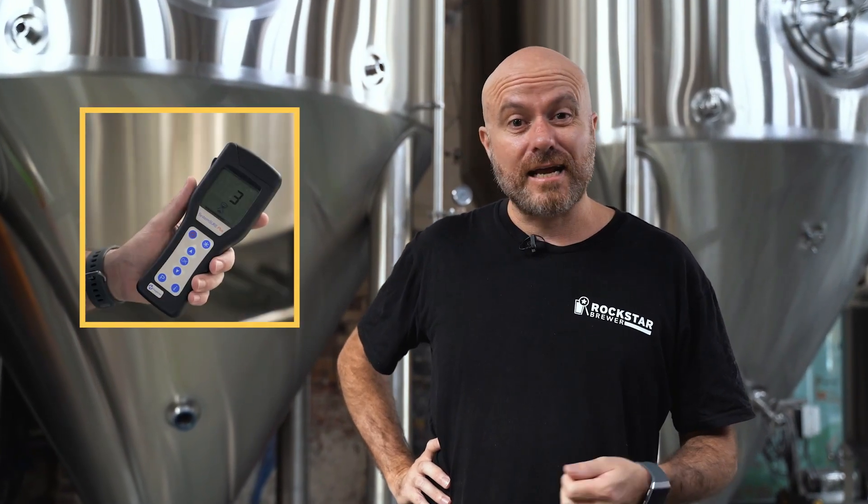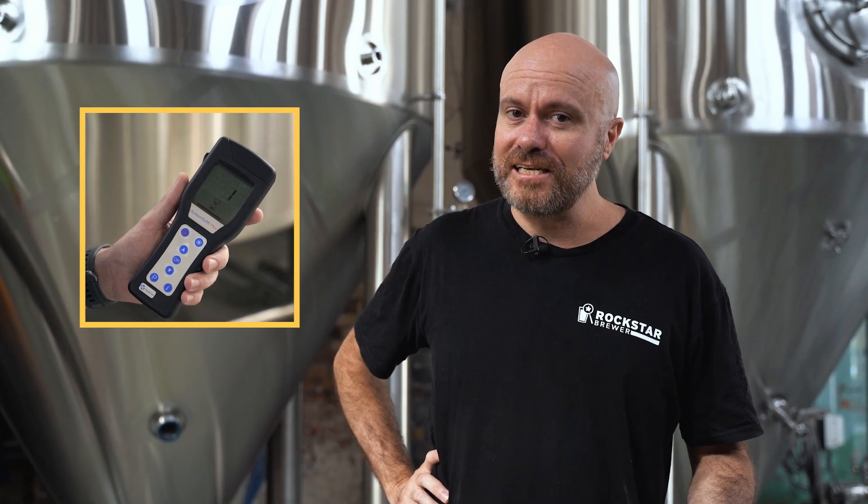One of the things I love in breweries is cool brewery tech, and there's a machine that can actually tell you if your tank is clean after you've done a CIP. Let's take a look at that.